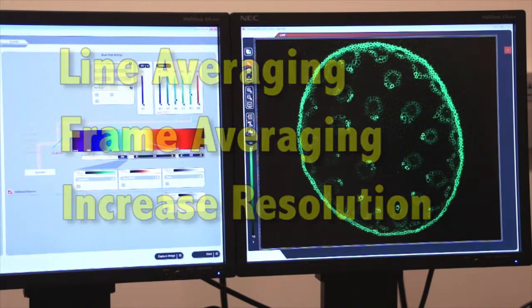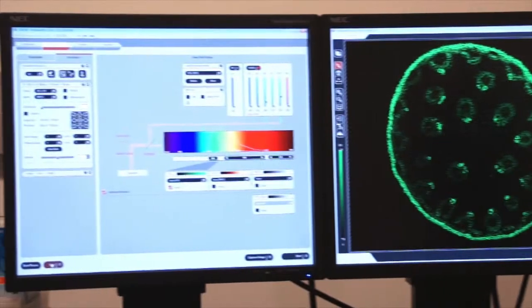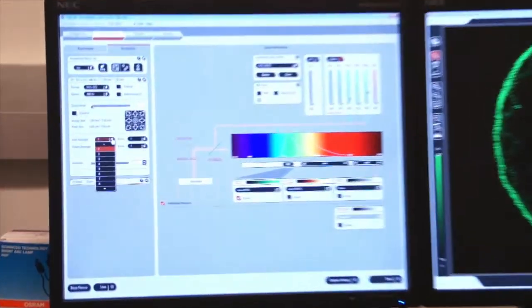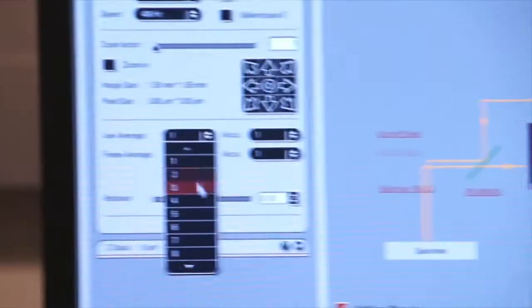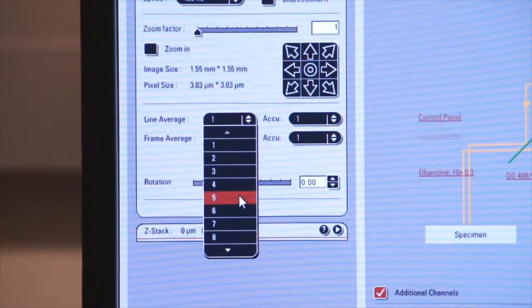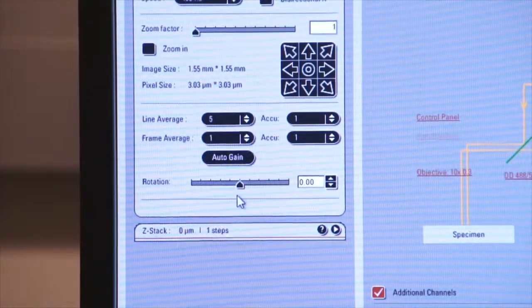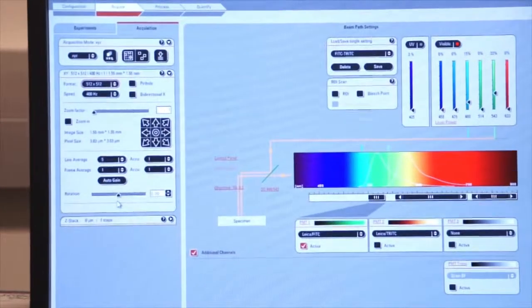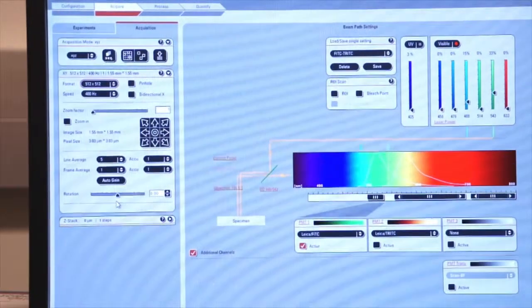So we'll click stop and we're going to come over to the left screen and we're going to select the pull down menu for line average. Let's do six line averages. So what are we actually doing? When I select six, I'm telling the system to read each line six times. And then make a final output image.